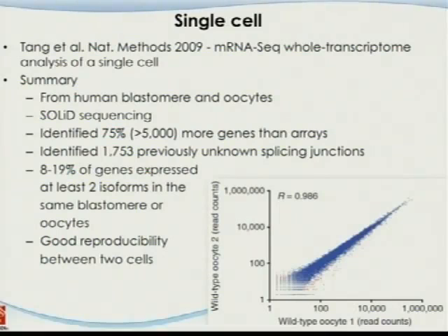And actually, we had some experiments working with the UCSC group. They also work on single cells. And our correlation between 2 individual cells is 0.7, 0.6. Okay? And I don't know how they achieved this high sensitivity. Yeah? What kind of cells were they? I have no idea. These are oocytes. These are big. You expect them to be fairly similar, especially if they're from the same animal.